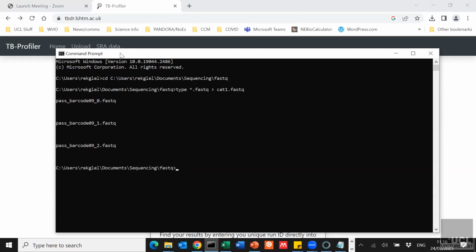And you found it, where is it? Oh yeah, there you go. See, that's why you need to, if you use that one, extra.